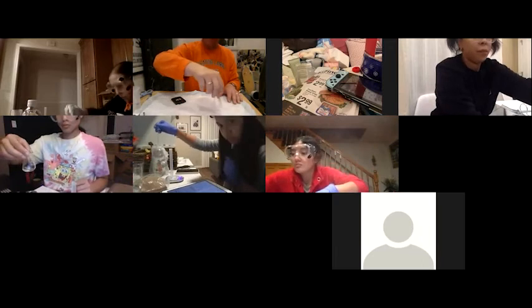There's your before picture. Remember, you want to photograph this against a white background. I've got white paper here, so that works nicely. But if you have a dark background you're working with, you're going to want a white piece of paper.